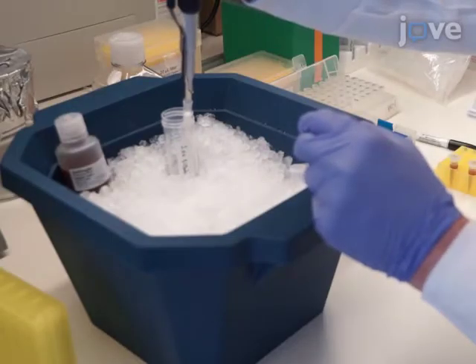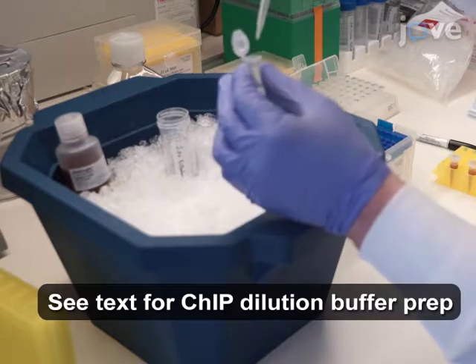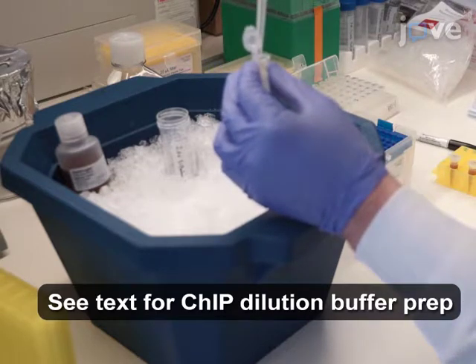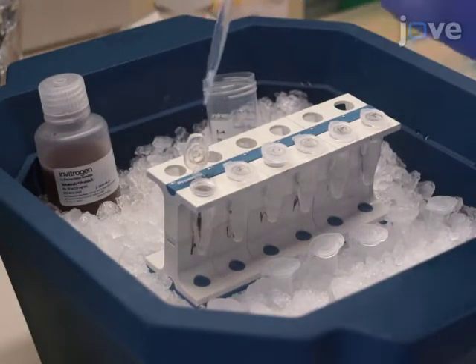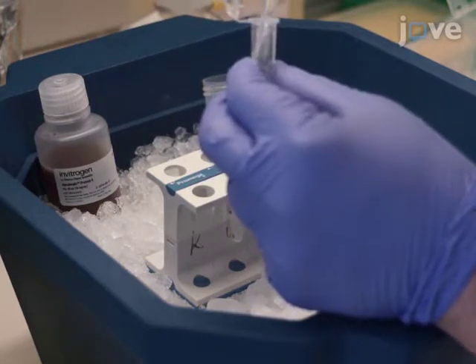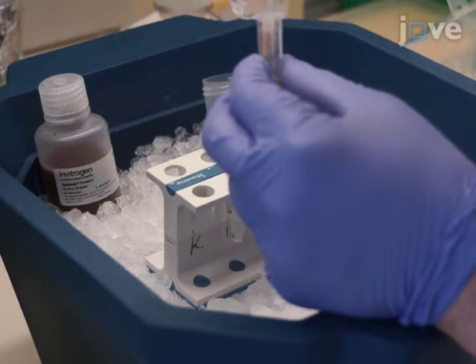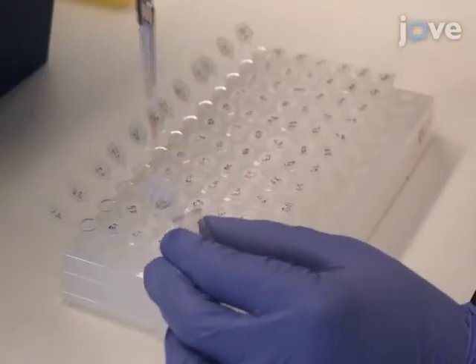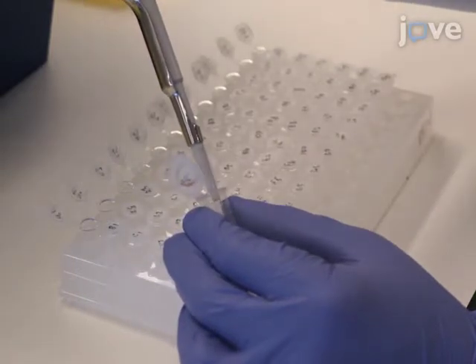After sonication, dilute the sample 5 times using ChIP dilution buffer to bring the SDS concentration down to 0.1%. After incubation of the antibody and protein G magnetic beads is complete, remove the ChIP dilution buffer and resuspend the beads in 240 microliters of the fresh buffer. Then, place 20 microliter aliquots of the beads into 12 separate tubes, each of which will be used for a separate tissue sample.